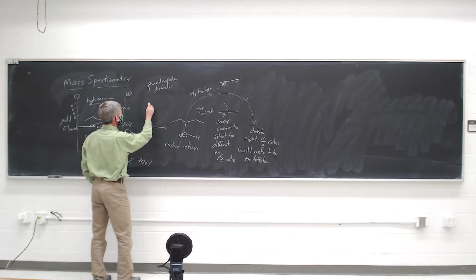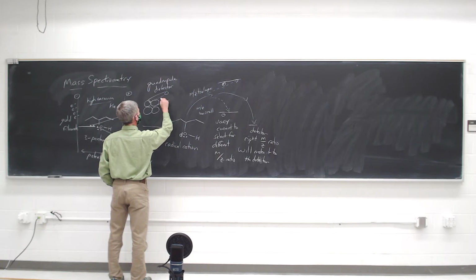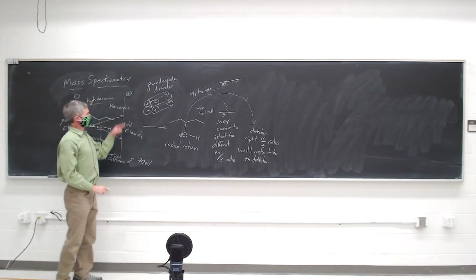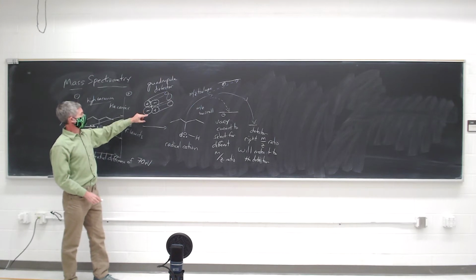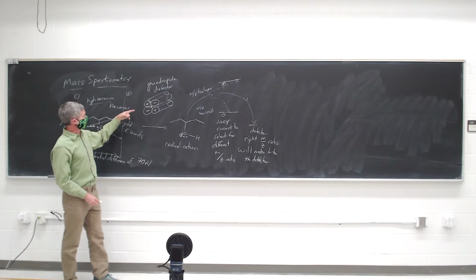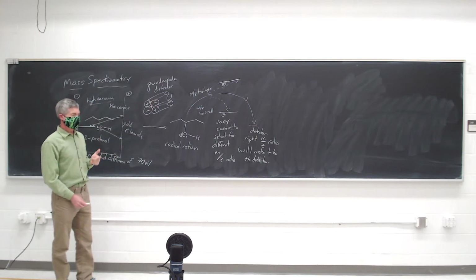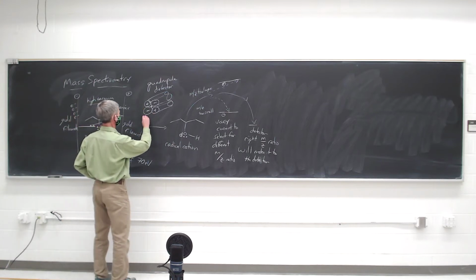And what our detector consists of is a series of metal rods. The particle goes through the center. We rapidly change from plus here to plus there, and your particle will actually go through. If it's too massive, it's going to have too much momentum and it's going to go crashing into one of these rods. And if it's got too little, it'll be repelled too hard and crash into the other rod. So we rapidly switch the polarity.